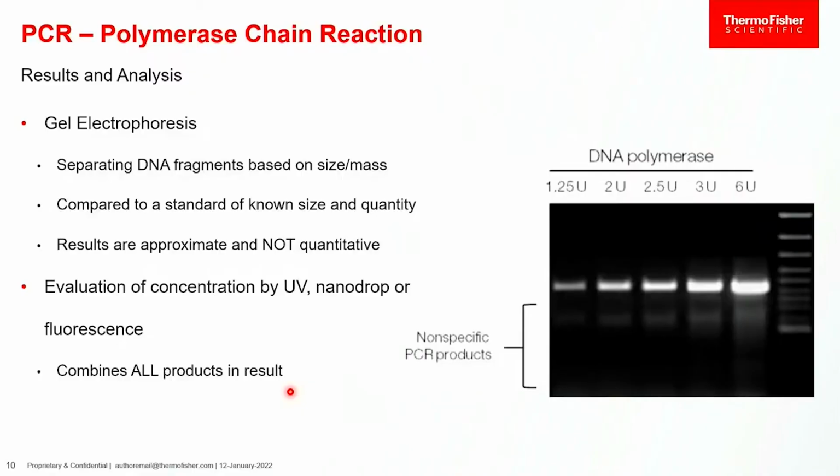Okay, so in this experiment, I just pulled this as an example. It's not intended to show you anything. Units are the amount of polymerase enzyme that was added to this reaction. So this experiment is looking at how much product you made versus how much enzyme you added, which really isn't applicable for our talk, but I wanted a nice picture of a gel. Units, yeah, and that's how we typically talk about a quantity of an enzyme. Yeah. Okay.